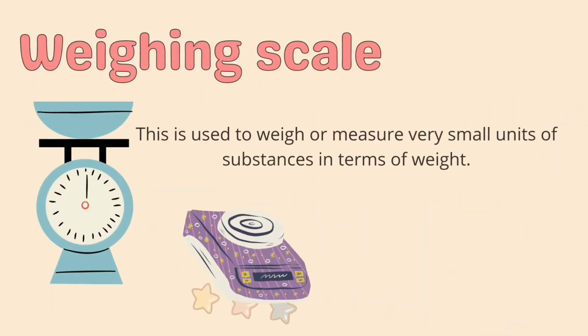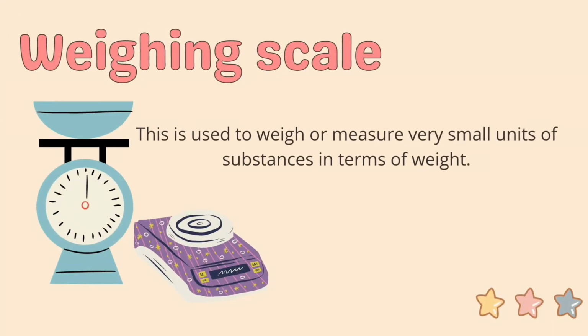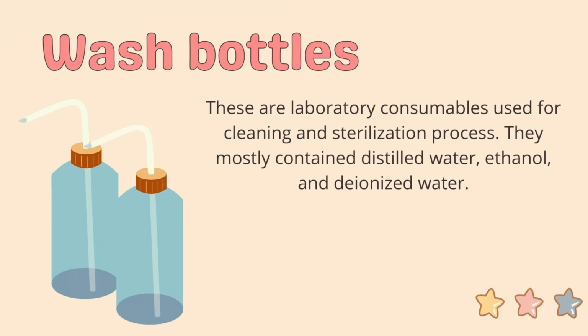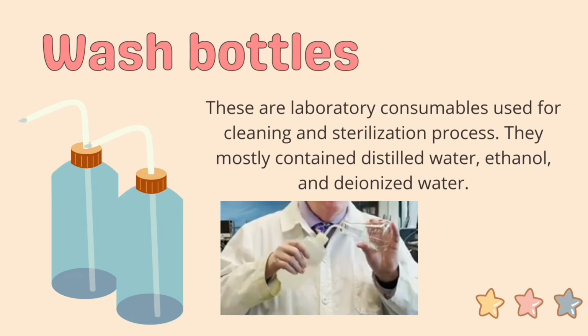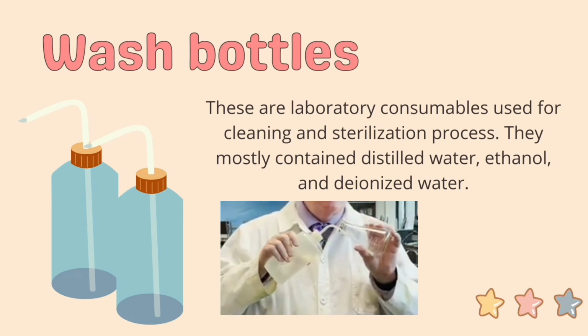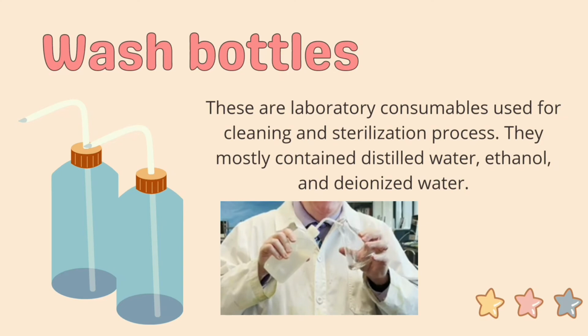The weighing machine or the scale. This is used to weigh or measure very small units of substances in terms of weight. Wash bottles. These are the laboratory consumables used for cleansing and sterilization process. They mostly contain distilled water, ethanol, or deionized water.